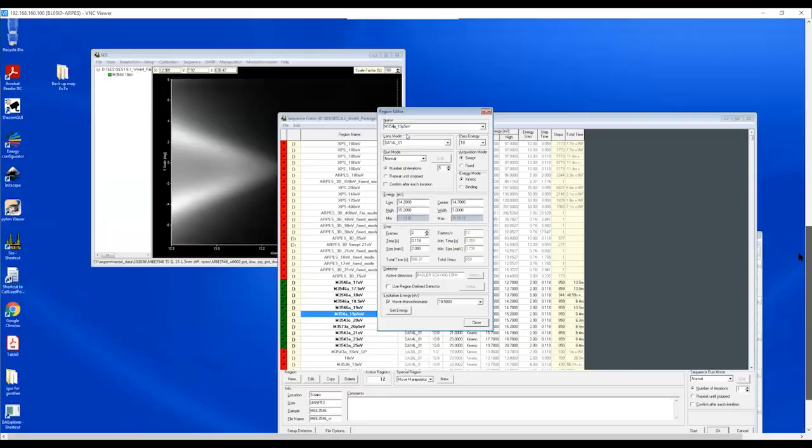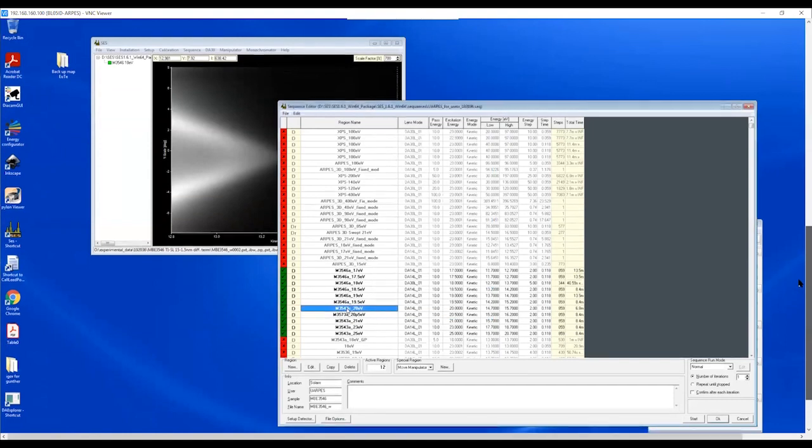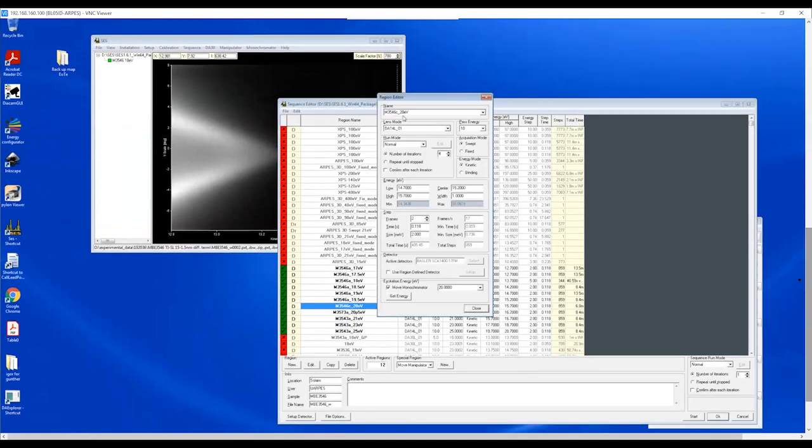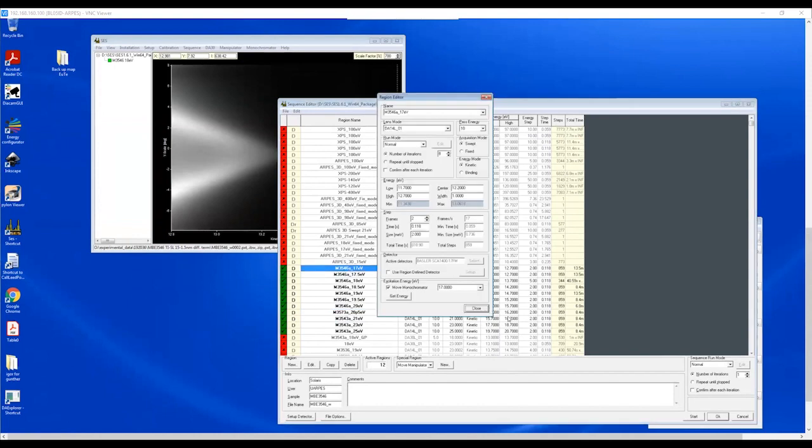Now, in our beamline the user works, and as you can see, the user changed the sequence in this program, and maybe we can come back to this window in the next step. And now we can go to the next beamline computer, where we can see the trends.